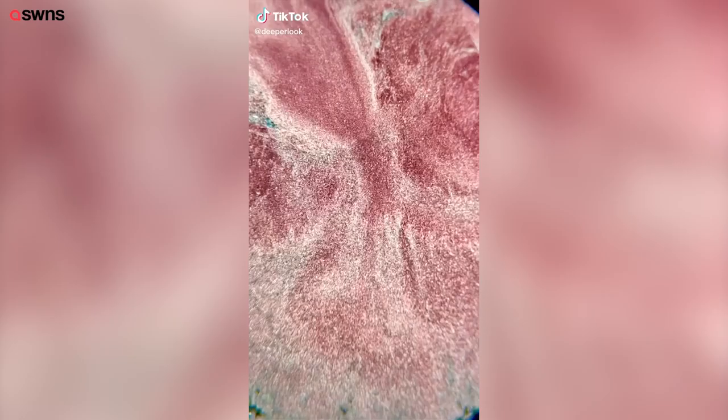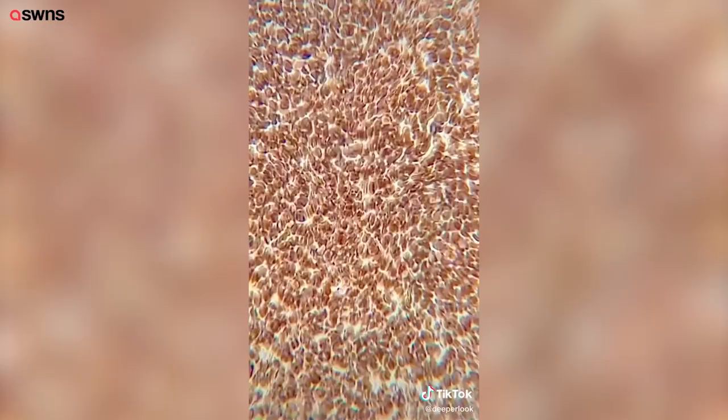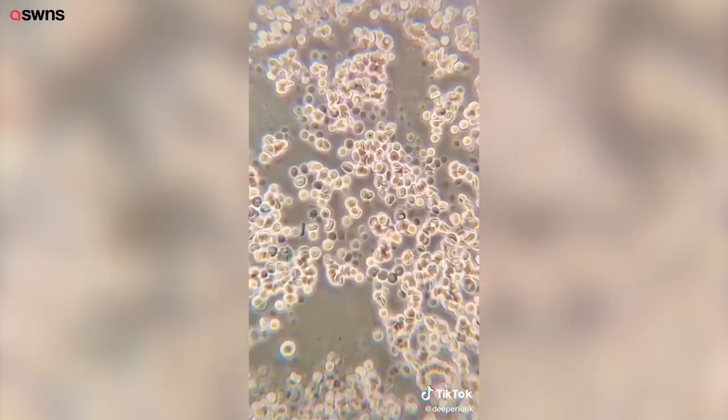A friend asked me to do some micro photography of her blood. When I put the sample under the microscope, I was just astounded at how many red blood cells there were. Without any dilution or smearing, they really do behave like a body tissue that just happens to be a liquid.